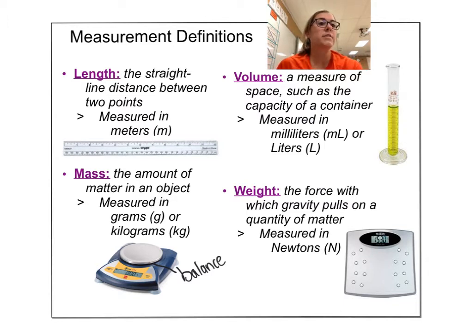Volume is the amount of space an object or a chemical takes up, or the capacity of a container, right? So a lot of times we're gonna be measuring the volume of liquids, but if you've taken geometry yet, or you did 7th grade math, you know that you can take the volume of an actual object, length times width times height for a cube, right? But for our class, we're gonna use probably liquids and measure the volume. We will be measuring in milliliters or liters. So milliliters is usually something in a graduated cylinder, but if it's a lot of liquid, maybe liters.